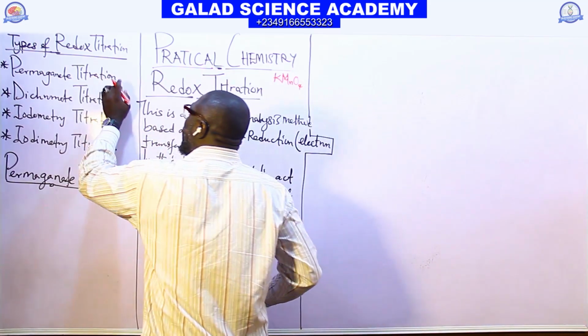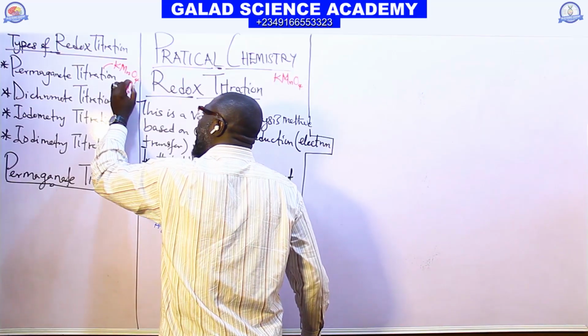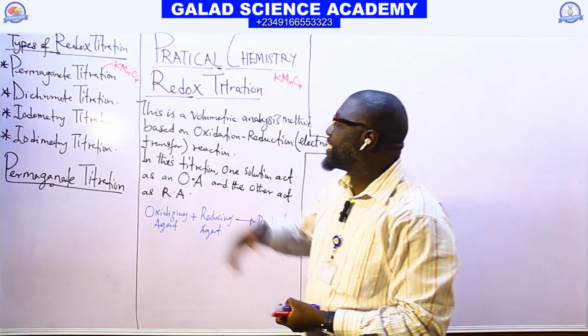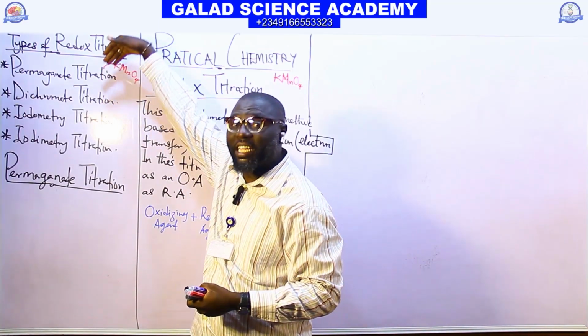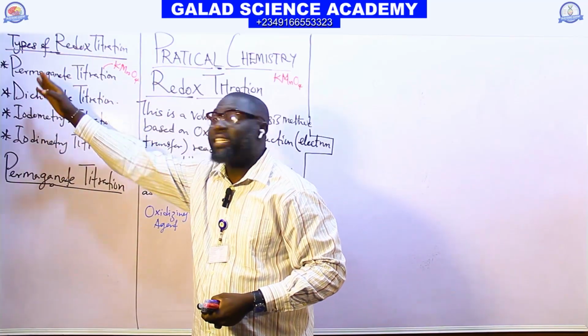When KMnO4 is used as a strong oxidizing agent for the titration, we call it permanganate titration.